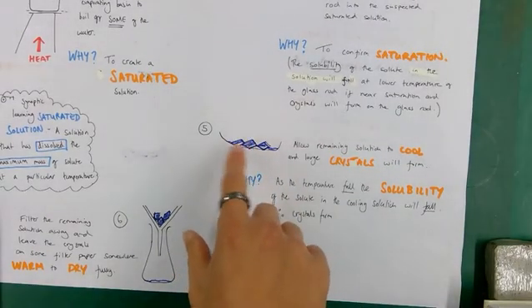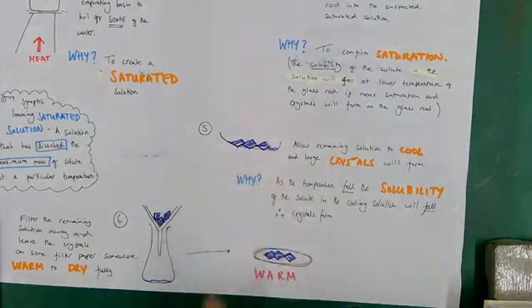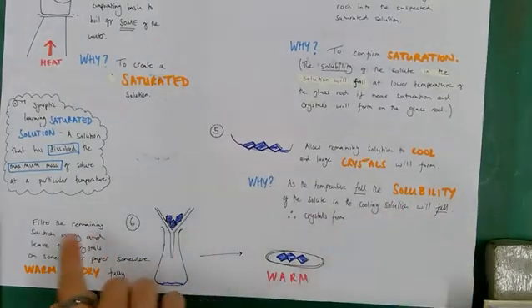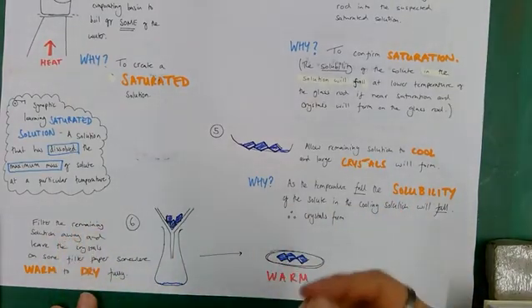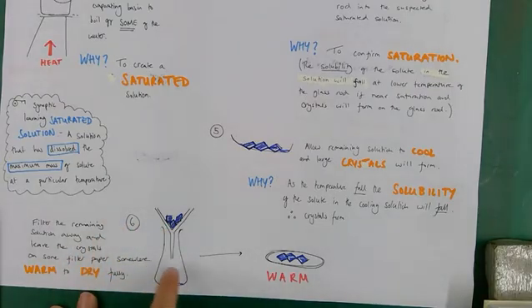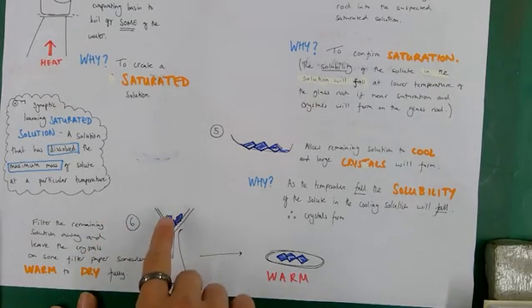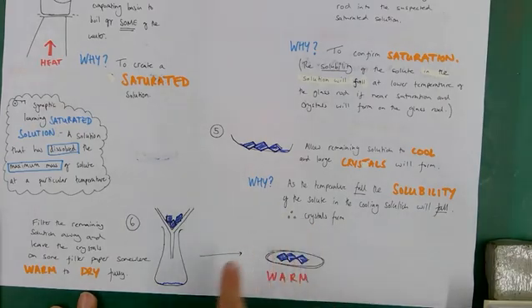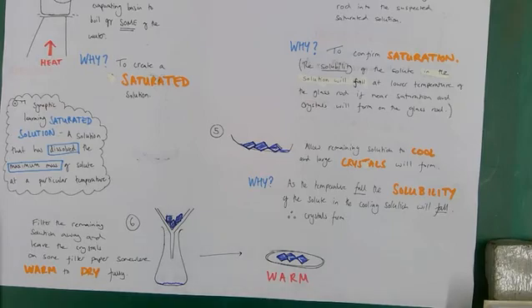After a couple of days, we'll have large crystals and a small pool of solution remaining. Filter the crystals to remove that last pool of solution, leaving just crystals on the filter paper. Leave them somewhere warm for the final water to evaporate, giving pure dry copper(II) sulfate crystals.